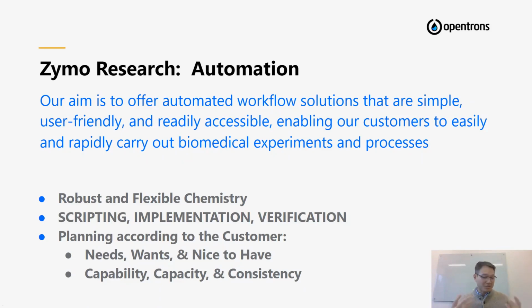Yes, the customer needs a script. Yes, the customer needs a kit. And they want to make sure that that script and kit work on a particular machine. But we realize it's also very nice to have a designed out protocol and a designed out presentation to give to customers. I think that's what Carlos was alluding to, is that when we provide a lot of our support, we try to not only help customers and students understand what they're about to do, but have a sense of familiarity, have a sense of, I can do this, I can achieve this.